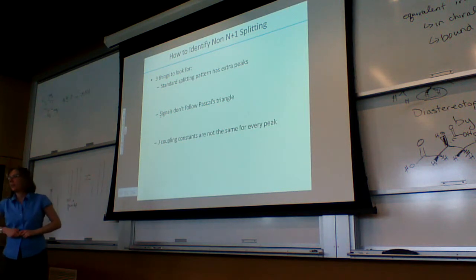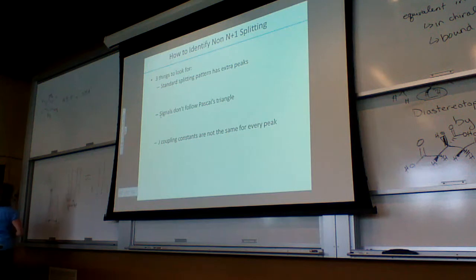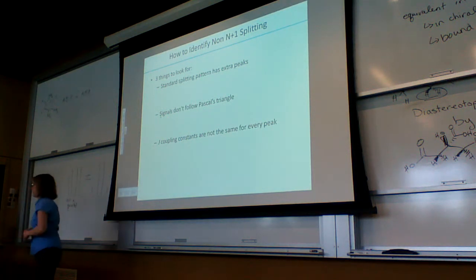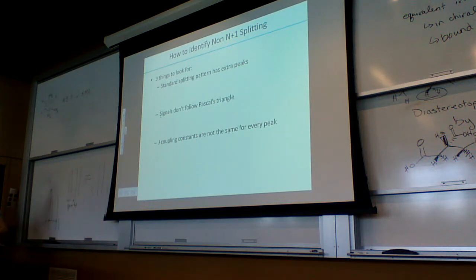How do we know that the one you said is not a quartet is not 2 doublets or 4 singlets? Like this one? Yeah. You would have to tell based on the integration value. So if this integrated to 1 compared to everything else in your spectrum, then you have to group them together and figure out what they are. They potentially could be different singlets that are just close together, but you just have to use some intuition to decide that.